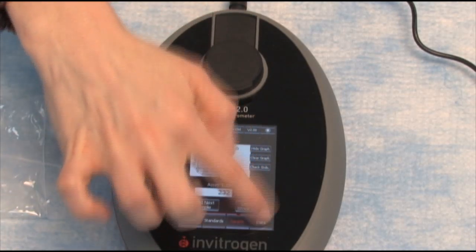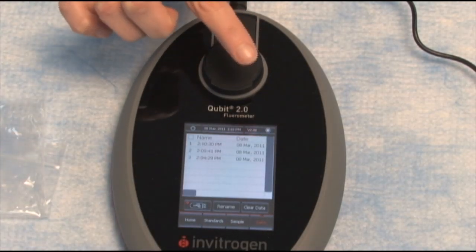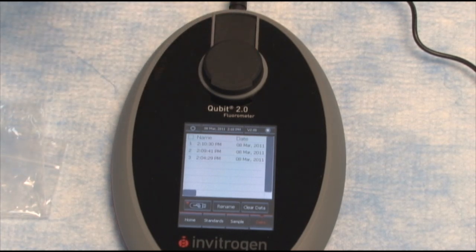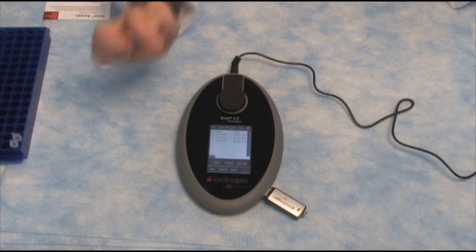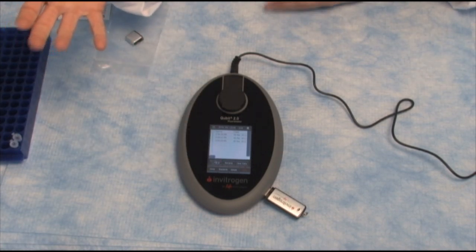Next, press the data button. Here we can set the date, set the time, rename our sample — whatever you'd like to do. But I'm going to make it really easy: take out my USB drive, insert it right here, and press the USB icon to save my readings. And that's as simple as that. We are done with the Qubit, done quantitating our RNA, and we're ready to move on into cDNA synthesis.